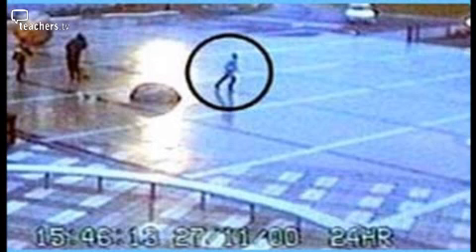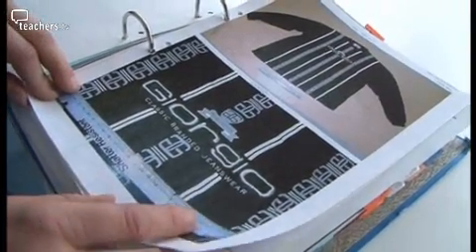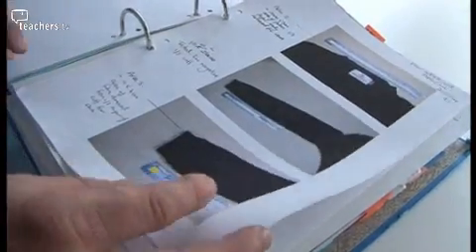There were two highly publicised trials in the Damilola Taylor case, which had not yet led to any convictions. The police approached our laboratory and they wanted us to re-examine the case. In the end, I had 20 lever arch files like this, which contained DNA profiling results and my statements. We were asked to examine a lot of items of clothing and footwear from the suspects in the case. We looked at a black sweatshirt from another suspect and we found a blood stain on the cuff of that black sweatshirt. In this case, we used a test called Luminol.